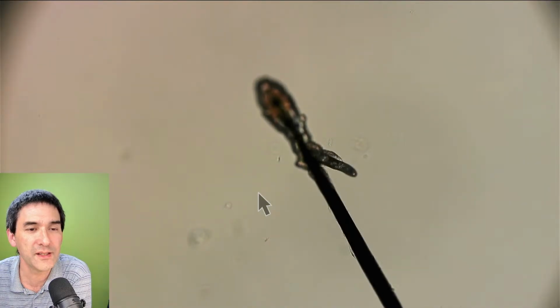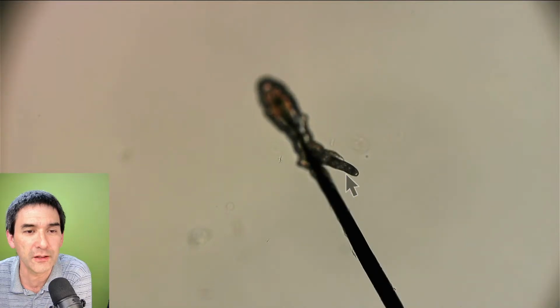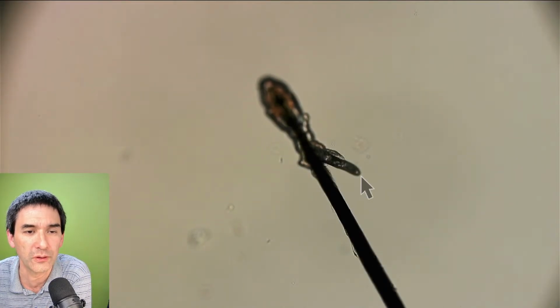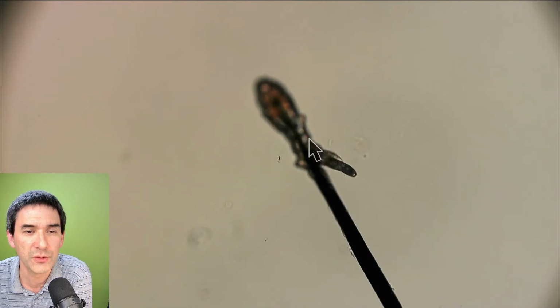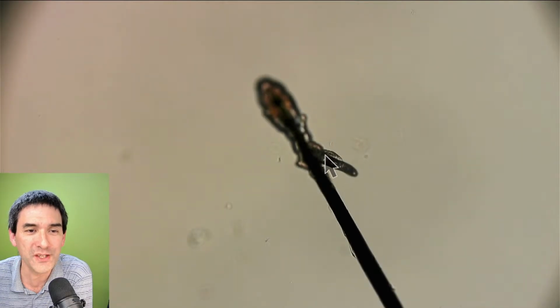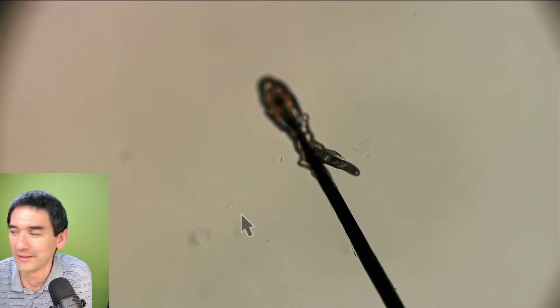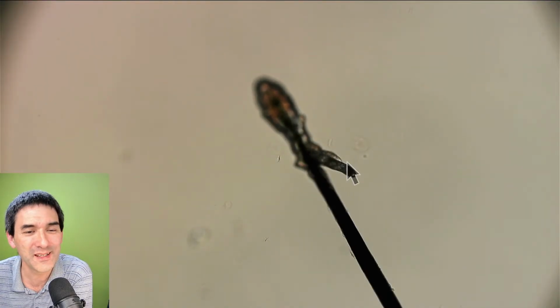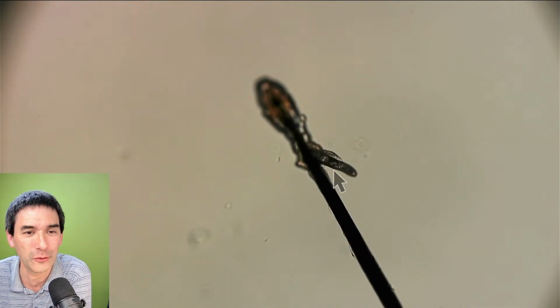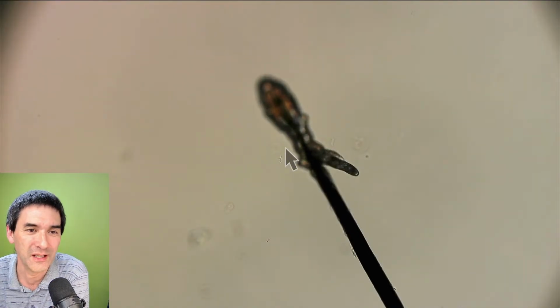And this is cool. This is the hair follicle. Do you see this here? I saw this tail here. It says, wow, there is still one of them here connected to the hair follicle, right? The video is now looping. That's why it's kind of jumping around, right? But then later on, this one was the one actually which started to crawl out and was separate. So at the beginning it was still here in the hair follicle. And then later on it was able to go out and then it was next to this here.